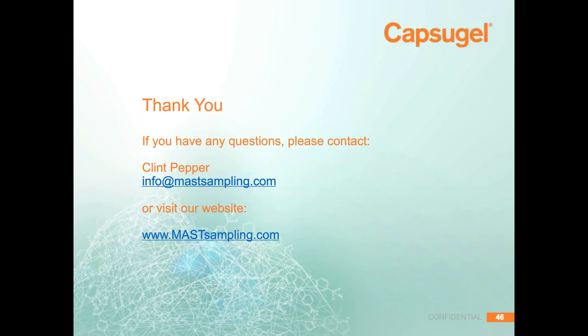So here's another question. It says cell removal system 30 samples per day or per system. Then how do you prevent samples from contaminating each other?